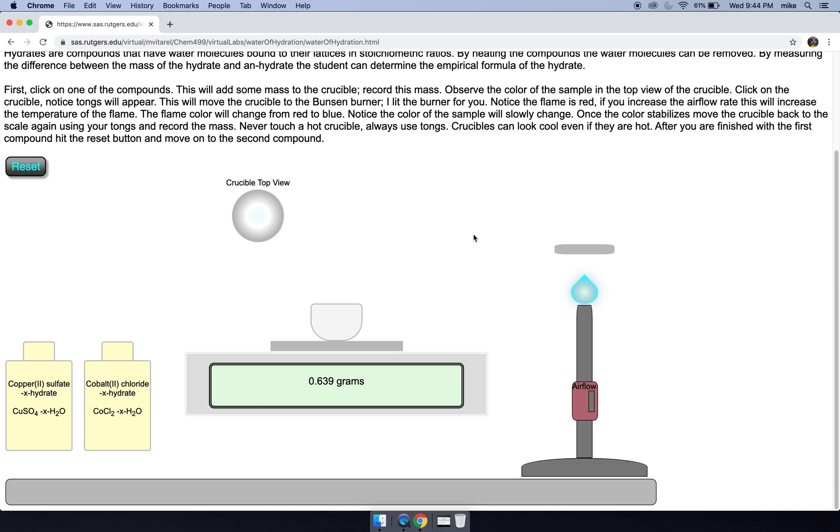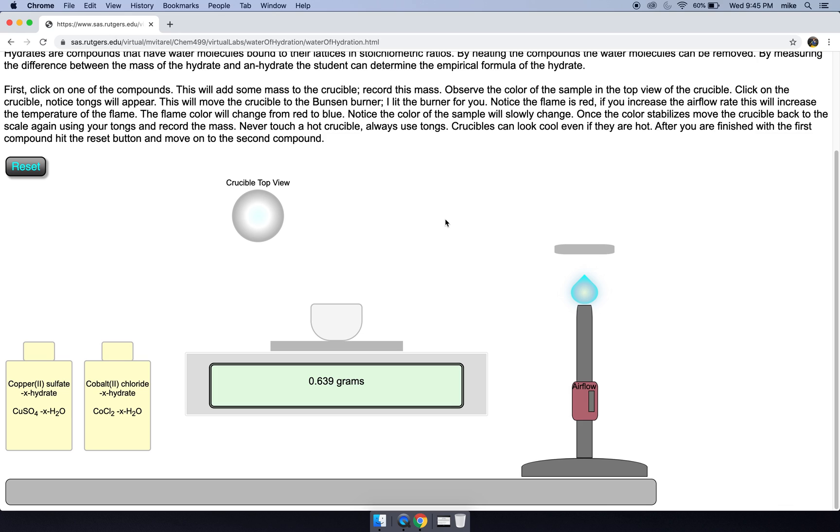The sample basically changed from blue to almost completely white. In the lab, it'll be very difficult to get rid of the blue in the very center here unless you leave it for a long time. So that's the first sample, goes from 1.000 grams to 0.639 grams.